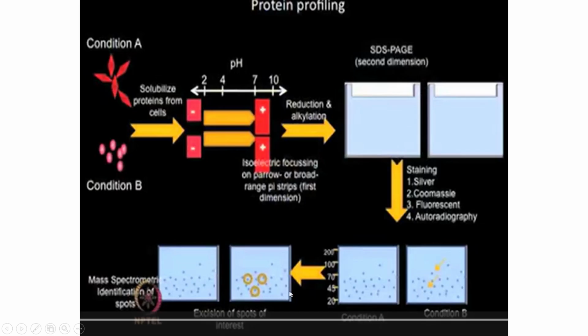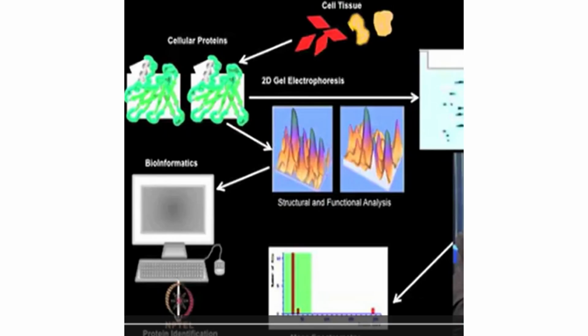So while doing analysis, you can exactly spot that this specific condition has led to some differential protein expression compared to that of this condition. This is one example of how you can apply this specific technique to understand that. This is the same thing, like you can analyze the intensity of it, do statistical analysis, etc.